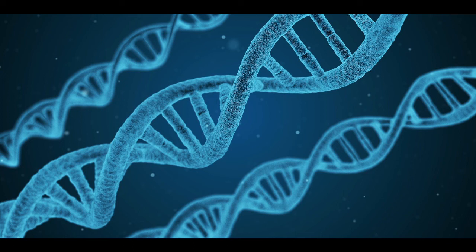It could have been like the thermocycler wasn't switched on, or she forgot to put the stain into the gel. I have a whole troubleshooting section in my protocol to help people figure out what exactly went wrong, because there's a whole bunch of things. But she did it again, and it came out good.